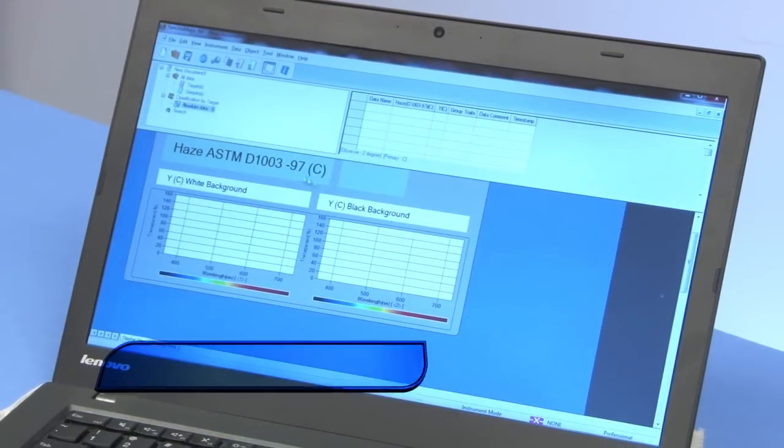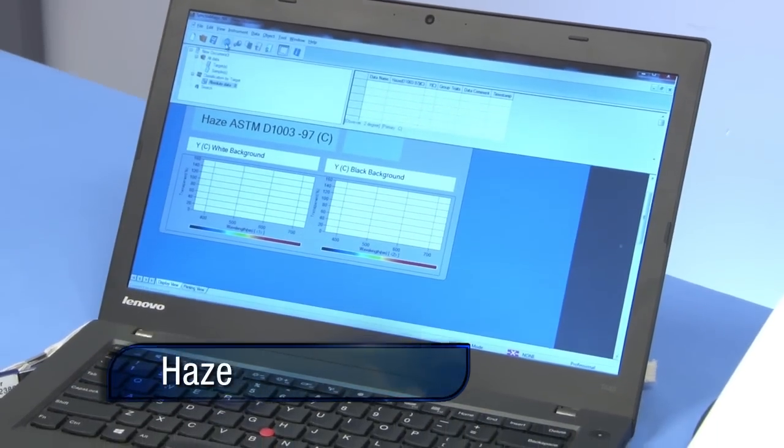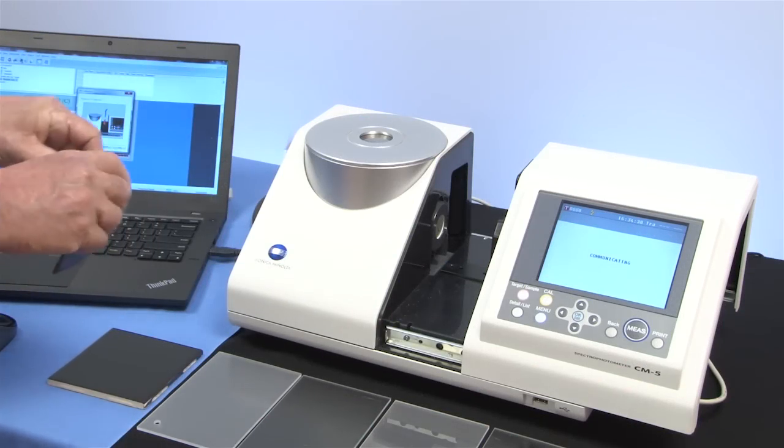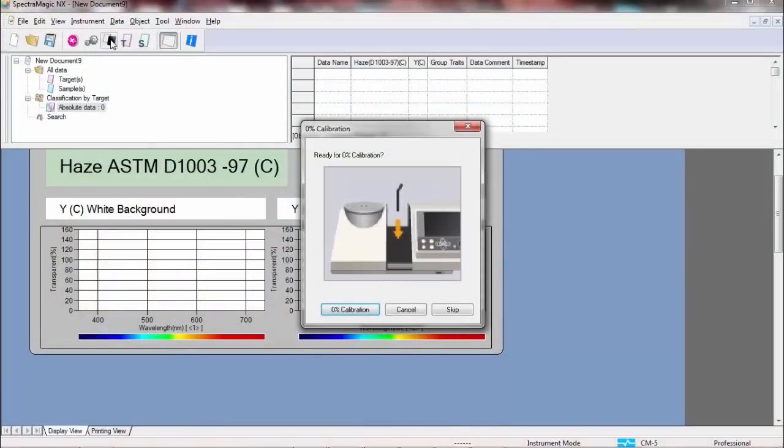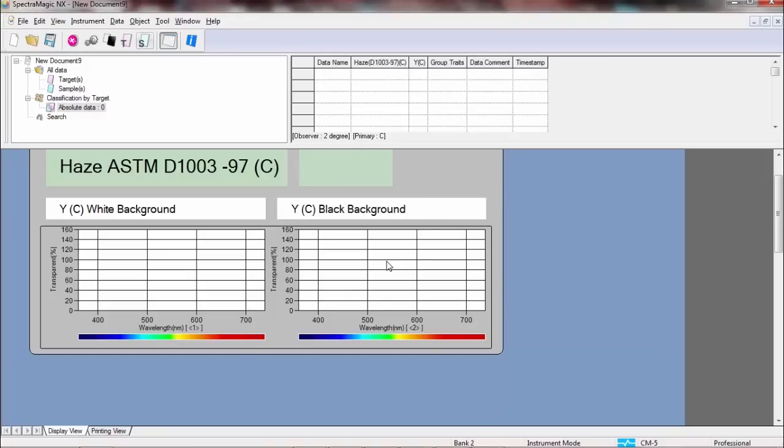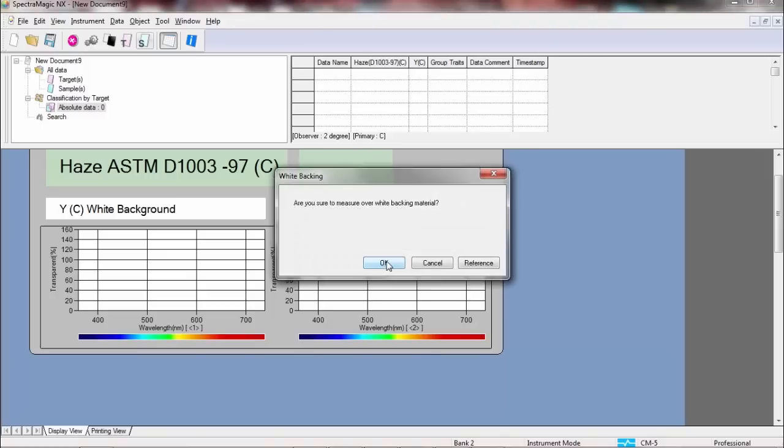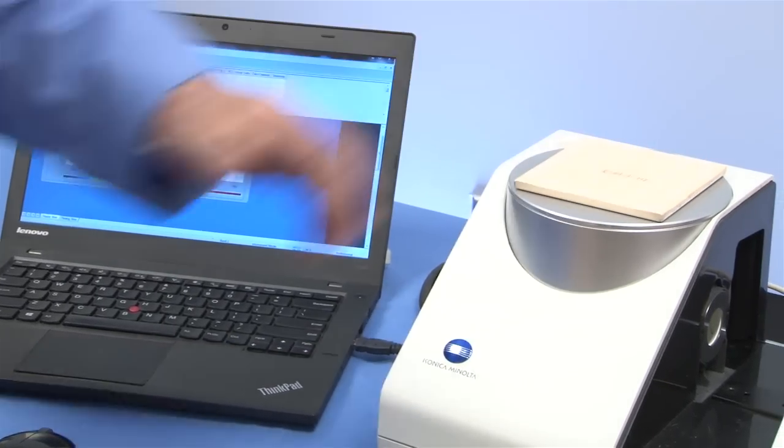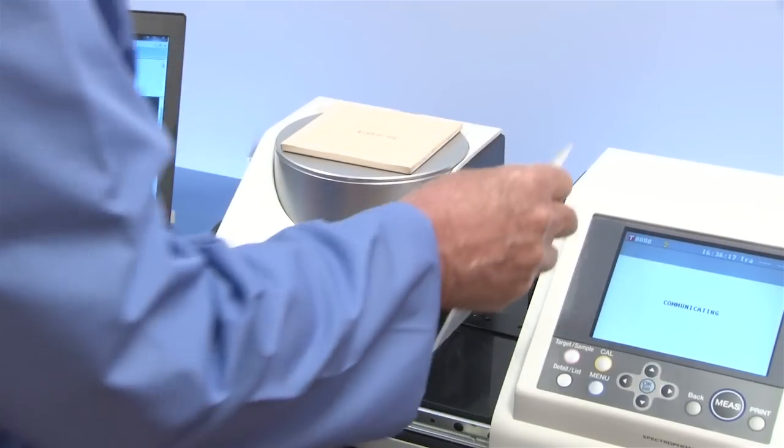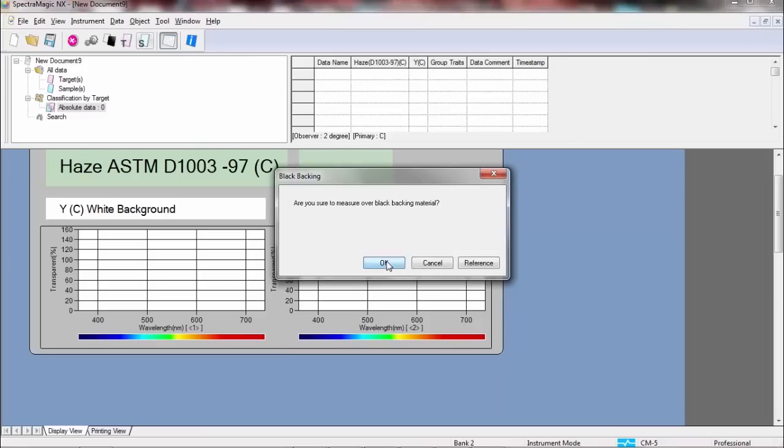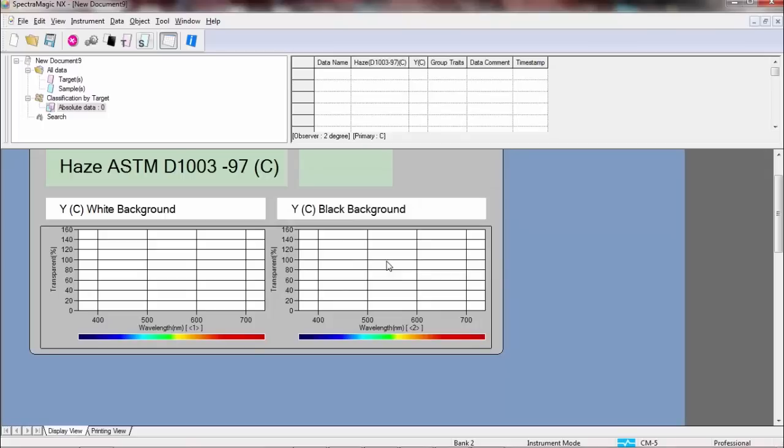For haze measurements, the CM5 is driven by user-friendly Konica Minolta Sensing SpectraMagic NX software. This procedure requires a measurement over a contrasting background. When creating a target, you will be prompted to take two measurements for each reading, one over white and the other over black. The reflectance port must be blocked. SpectraMagic NX allows for measurements of haze with the use of a custom template, an important quality control procedure for many industries.